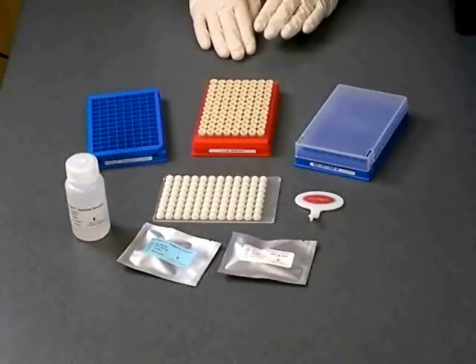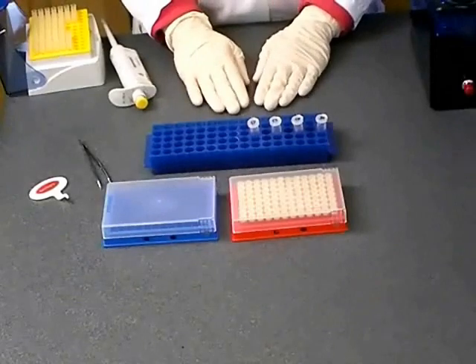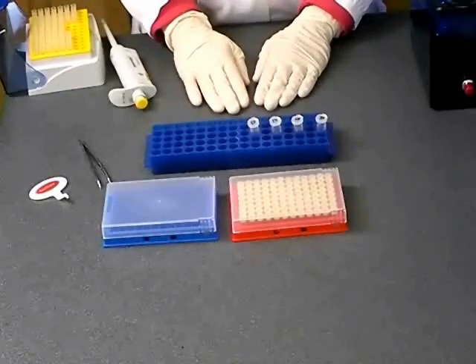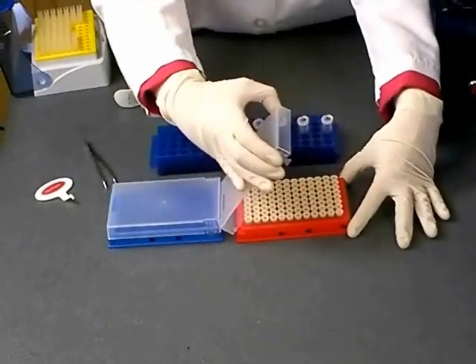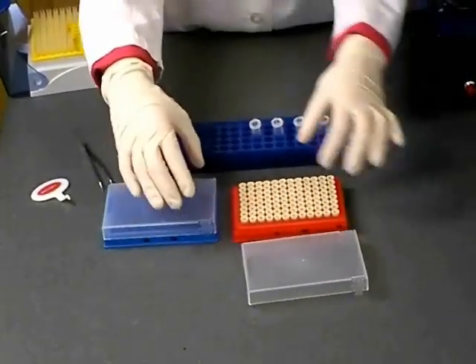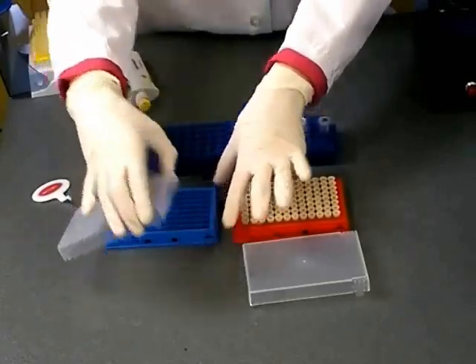To begin, remove the lid from the rack of Gentegra tubes by squeezing the corner tabs and the lid from your working rack. The working rack is used to apply sample to your Gentegra tubes without contaminating your remaining unused Gentegra tubes.